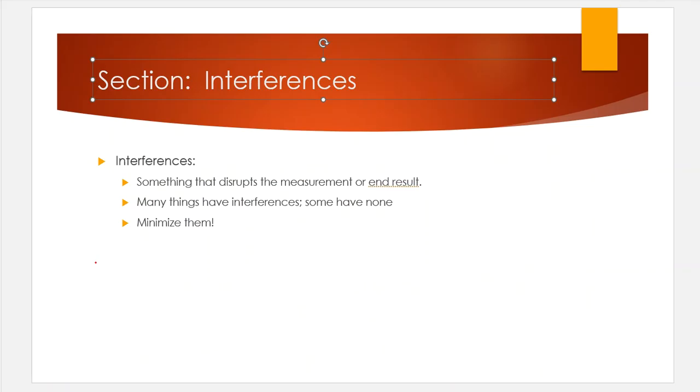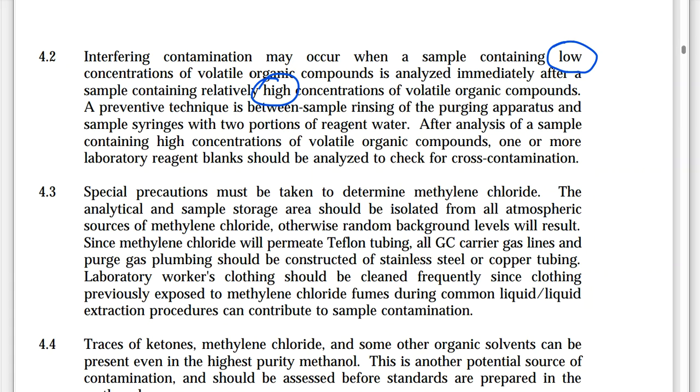Now, with our standards, we can do that without a problem, right? So our standards that we use in a laboratory, we know what those are. We made those. We've put those in there. I can analyze those from low to high if that's what's going to be needed here, and very often that's exactly what's done. So for instance, when I make my cal standards, most of the time I go from my lowest concentration to the highest concentration for this particular reason.